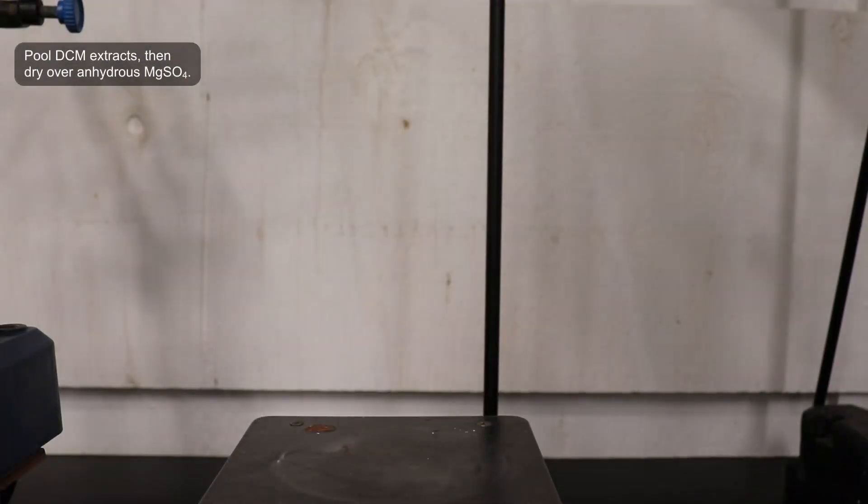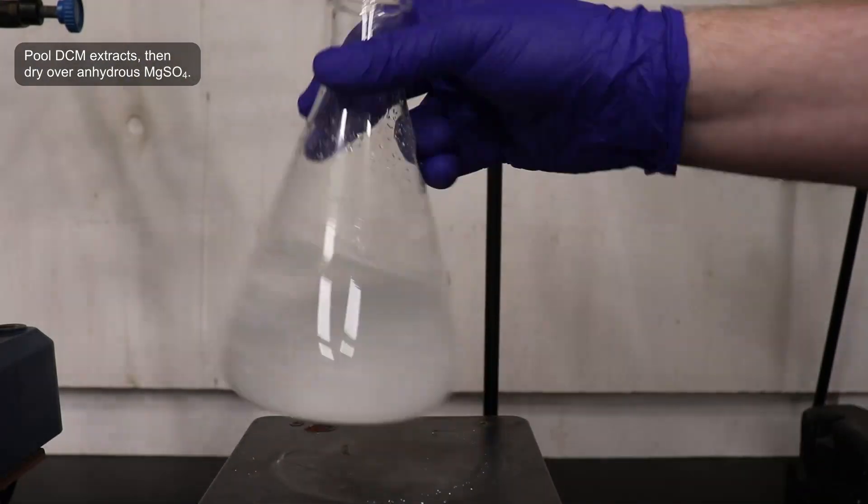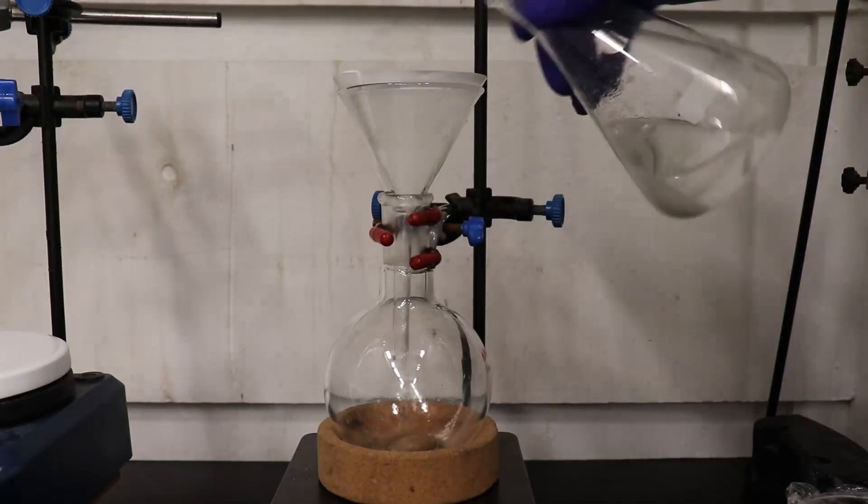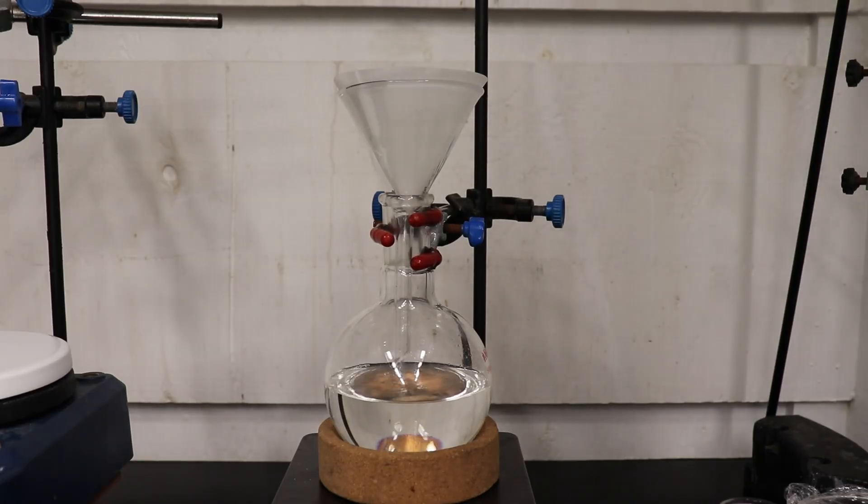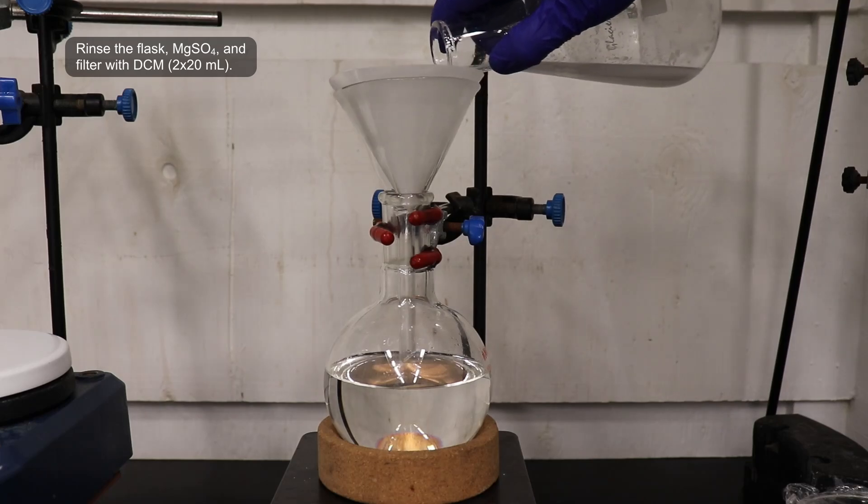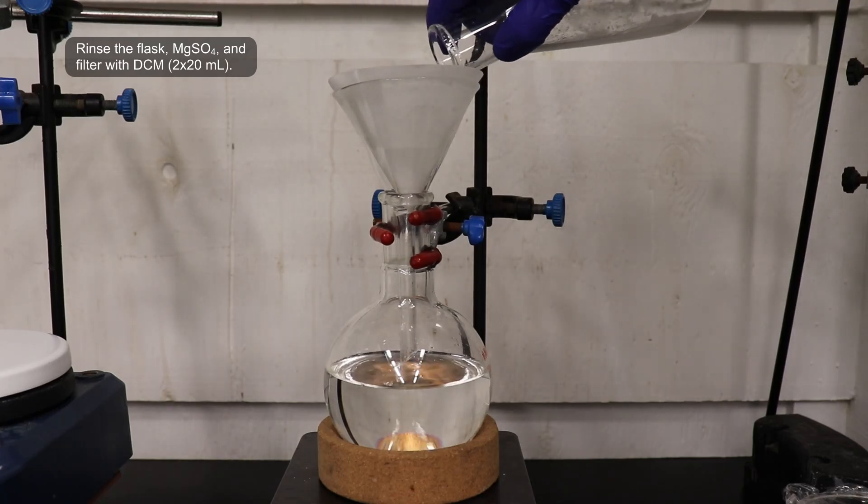The 3 DCM extracts were then pooled together, and dried over anhydrous magnesium sulfate. This solution was then filtered into a 500 mL round bottom flask, and the residual magnesium sulfate was washed with 2 20 mL portions of DCM, to ensure a quantitative transfer.